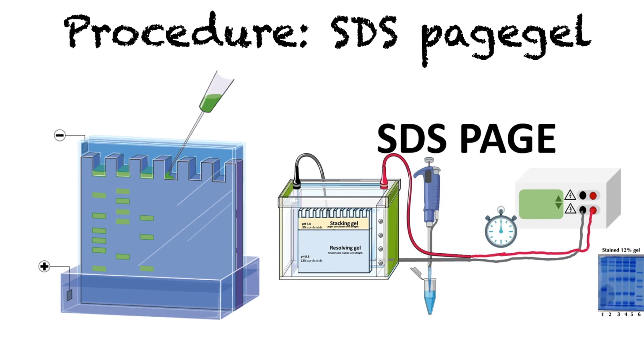And if it's a protein, we also see a similar kind of band in the gel, as you can see in the picture. The only difference between agarose gel and SDS-PAGE gel is that agarose gel uses agarose and SDS uses polyacrylamide, and generally SDS-PAGE is used to separate or denature protein, and agarose is used for separating DNA and RNA molecules usually.